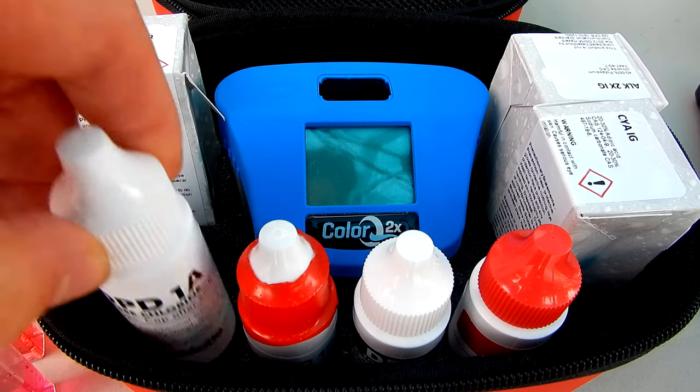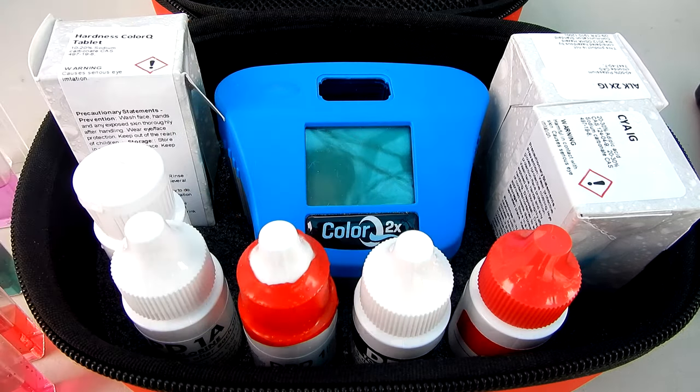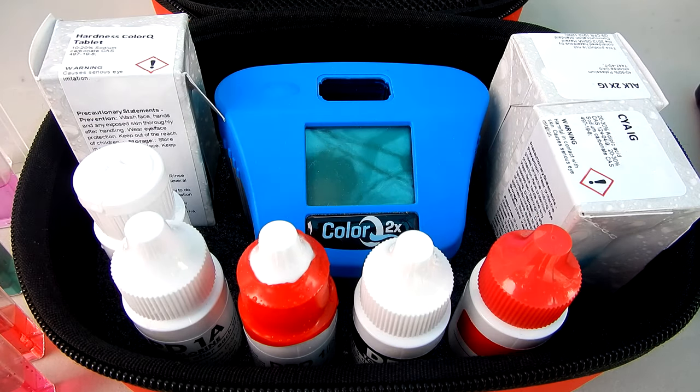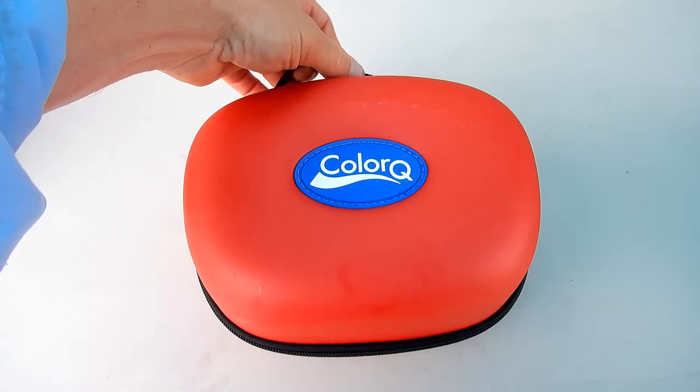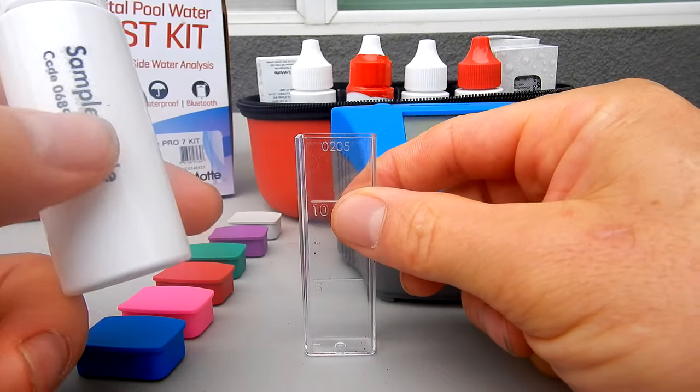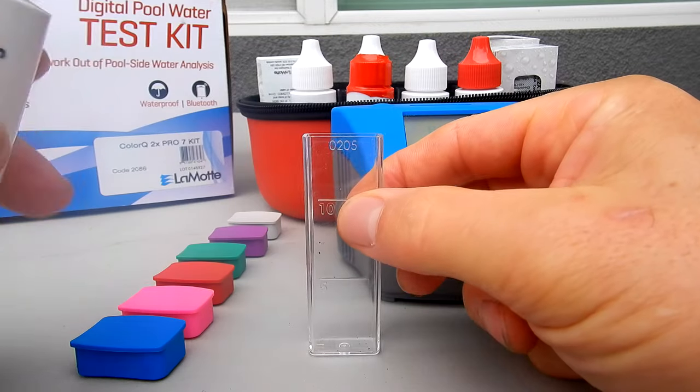The ColorQ test kit has always been very easy to use — it's five drops of each reagent — and now with the tablets it makes it even easier to get the exact reagent measurement. I like this nice storage case that the 2X comes in, and doing all the test factors is very easy. I have a separate video filmed doing all the test factors in real time that you can refer to.